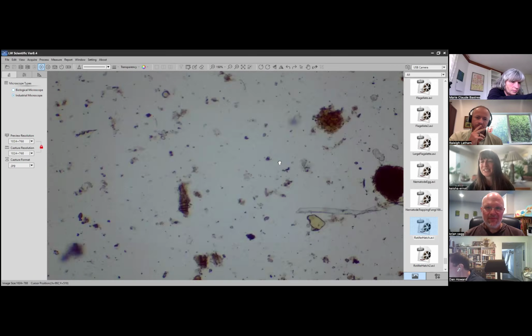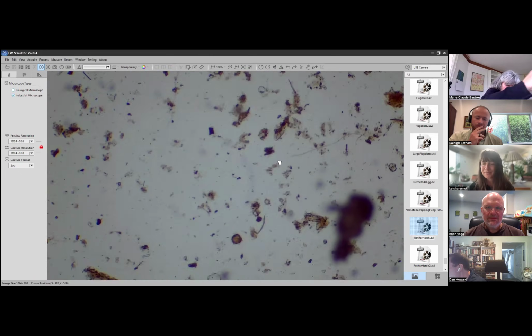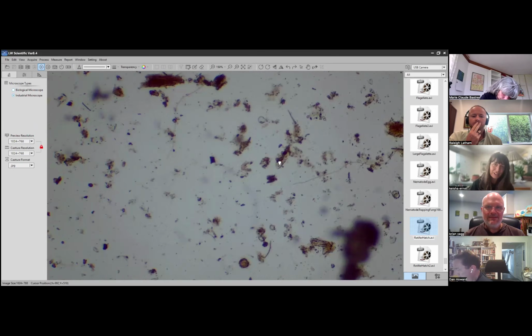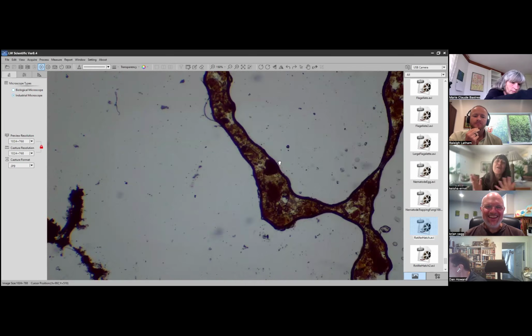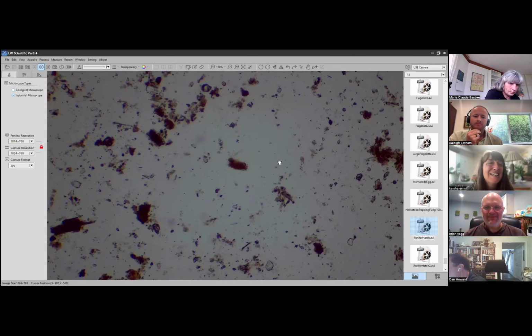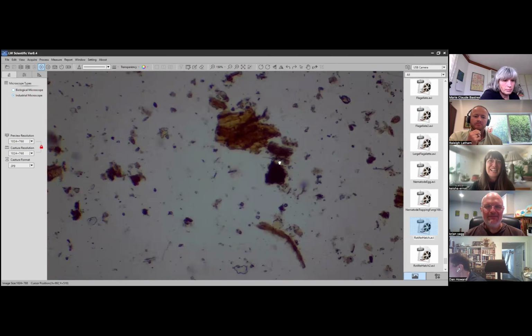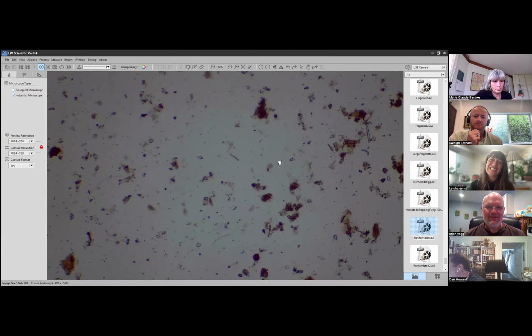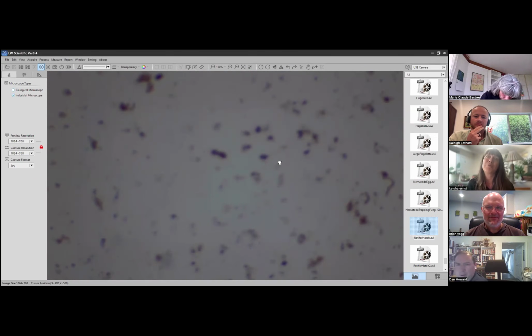Then Stacy was asking about that broken amoeba. Would you count it in an assessment? I mean, we're talking soil food web school here again, Stacy. I'll tutor you on that. I wouldn't count it if the shell was broken. But if you were to count it, it wouldn't be the most horrible thing. Even when we're looking at SMAP, it's a guess. You're really trying to identify how many amoeba am I seeing, and that one was pretty big.